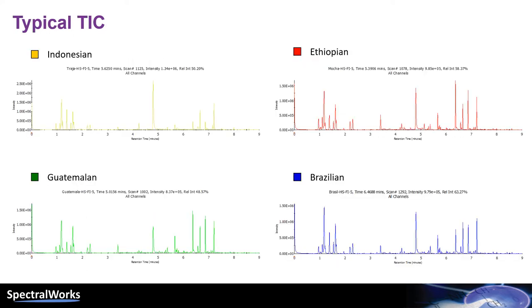Here we can see typical total ion chromatograms for the FI data channels from a sample in each of the geographical locations. At a quick glance, it is obvious that the samples are very similar.